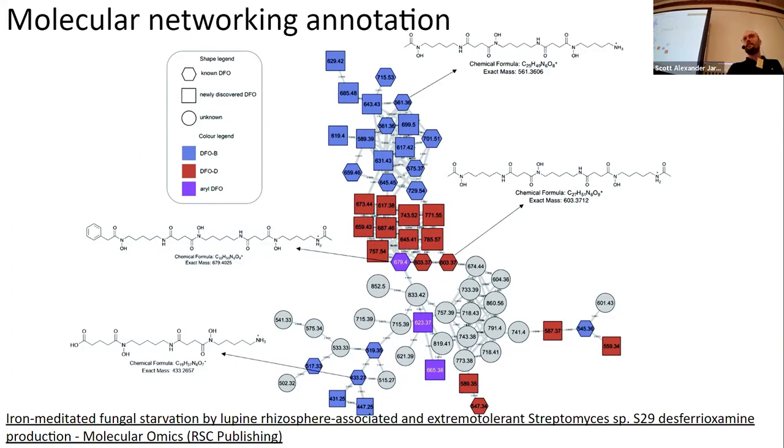In this case, it's very simple because these compounds are oligomers, and so you can just piecewise build them up. For peptides, this is a much easier process. Fatty acids too. For more structurally complex natural products or other metabolites, this might not be feasible. So you have to be very careful with your annotations. Again, you add confidence levels to your annotations.